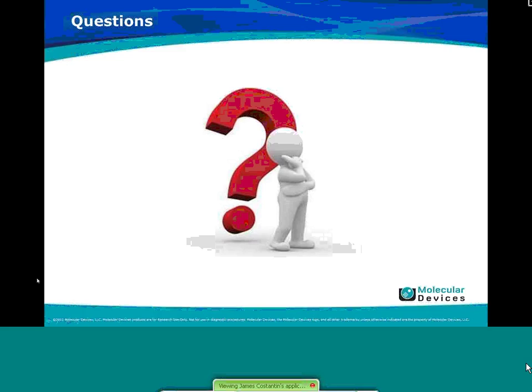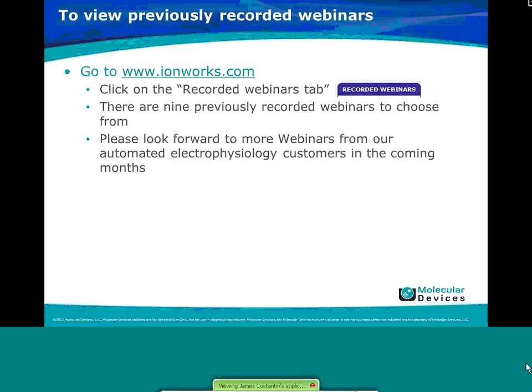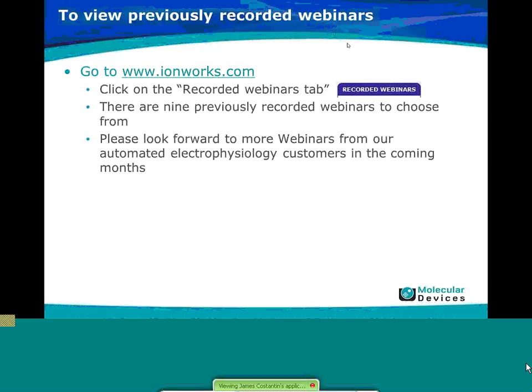One more question for you. Do you observe differences in the apparent potency of inhibitors when you pre-incubate versus simultaneous addition with ligand? Yeah, well, I think I addressed that in the presentation. We do see for open channel blockers like picrotoxin that there's clearly kinetics, that is, the decay times that are induced by blockers entering the open channel show that you get much more block towards the end of the waveform than you do by looking just at the peak. So I think that's one of the big advantages of running these assays in the Barracuda, because the simultaneous addition of a ligand together with the inhibitor can give the on rate for open channel blockers, whereas with pre-incubation you lose that information. So I think that's a great advantage of the instrument.